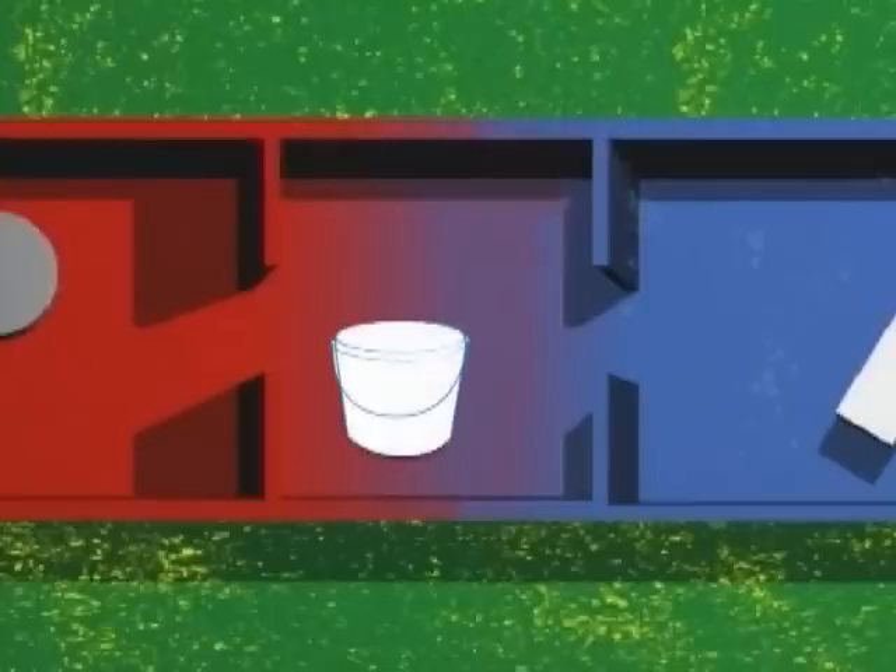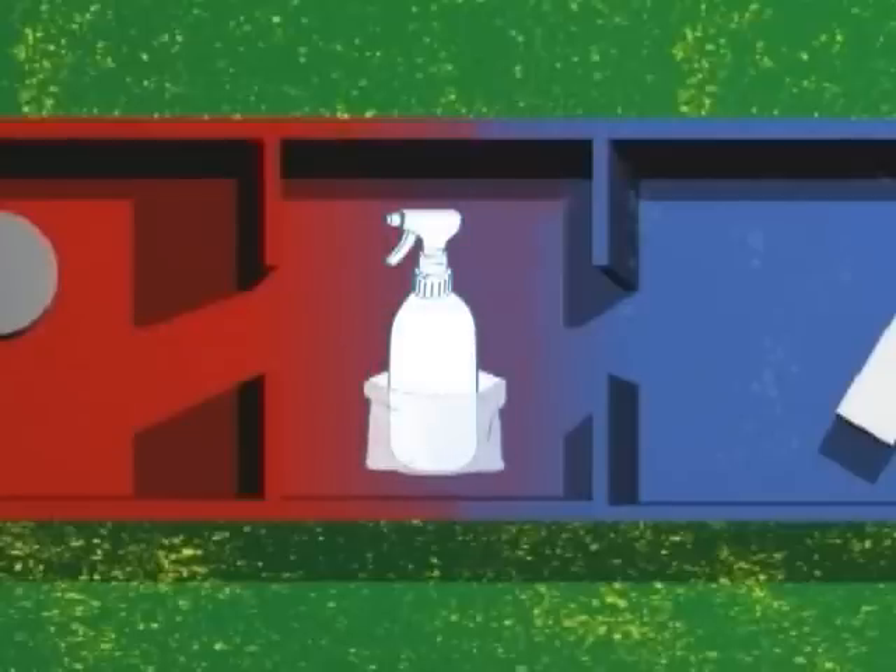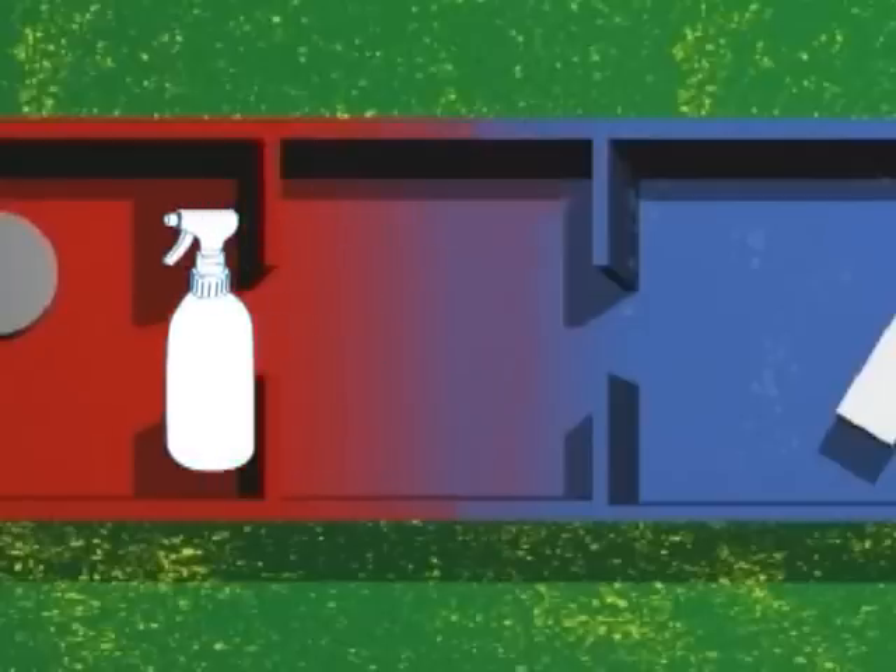If the disinfectant is a concentrate, the in-use solution is prepared with water in a bucket, which has also been passed through, and the bucket with the prepared disinfectant solution is taken into the sterile room. If the disinfectant is a ready-to-use product, for example in a spray bottle, this bottle is taken into the sterile room.